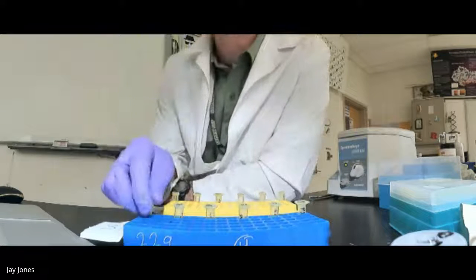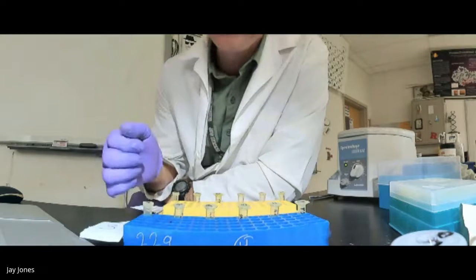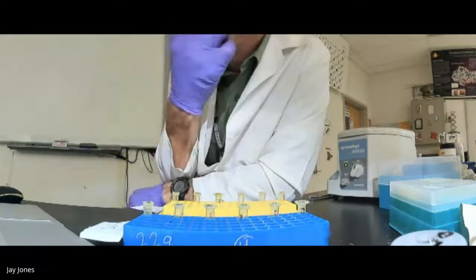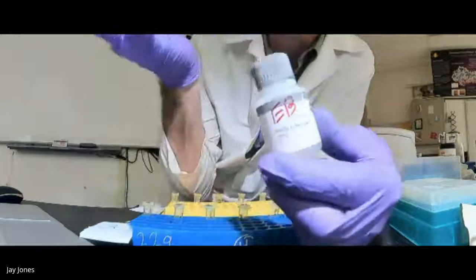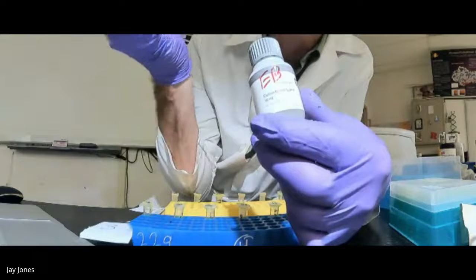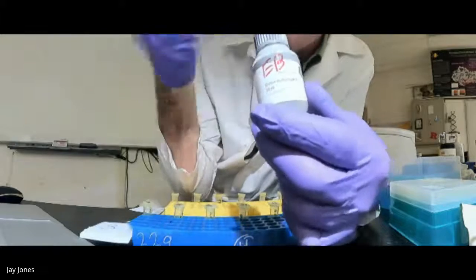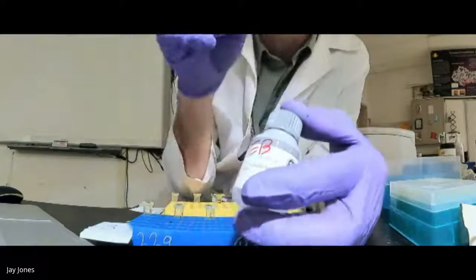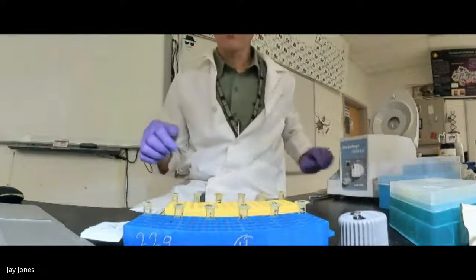So we have to get the DNA into these yellow tubes. But it's stuck to the column. The DNA plasmids are stuck to the column. We have to get the DNA off the column into these tubes, and we're going to do that with this stuff. EB, elution buffer, and I love this word. Elution means to wash something off of a surface and take it, or just to pull selectively something from a surface. It's called elute. It's a verb and a noun. You use it differently. And so you're eluting. We're going to elute the DNA from the column. Pull the DNA off the column.